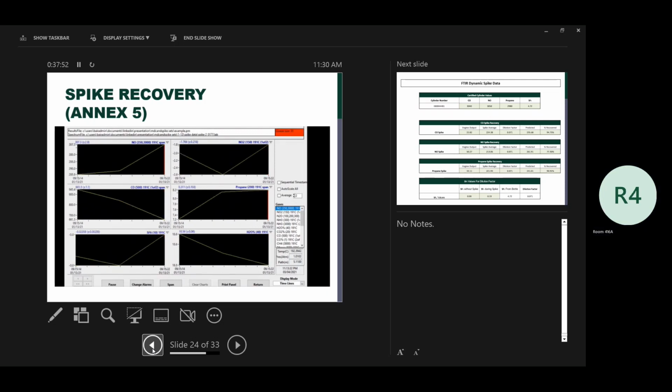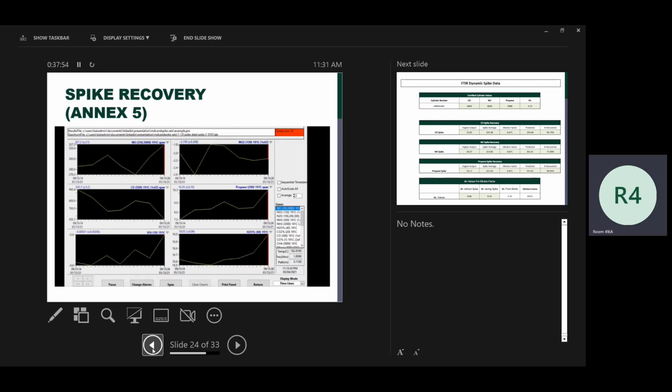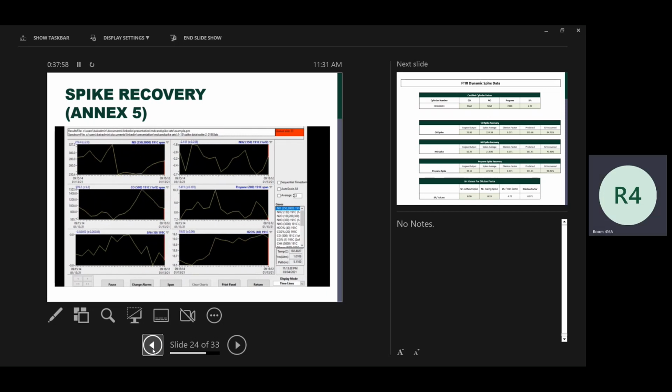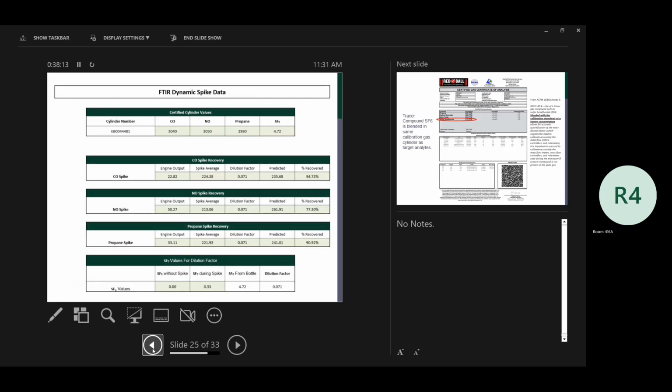Yeah, that's NSCR. This is just a screenshot showing that the SF6 is being spiked in. You can see it slowly but surely coming in. The bottle is probably 5 ppm SF6, so it's showing that we are in fact adequately transporting the analytes of interest. Percentages. It's just an important thing to do.